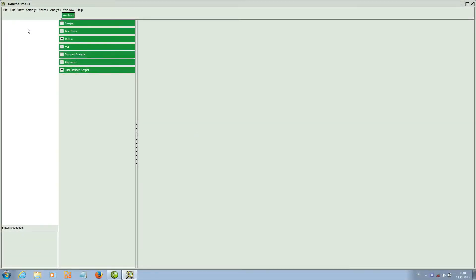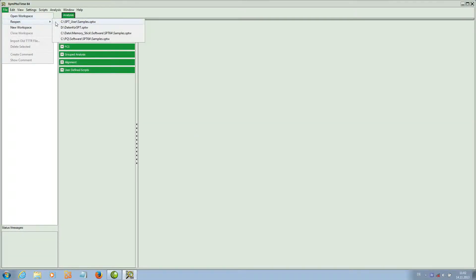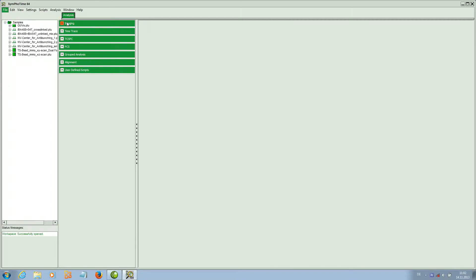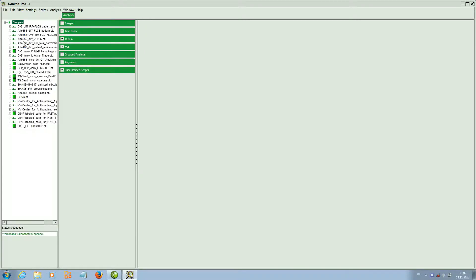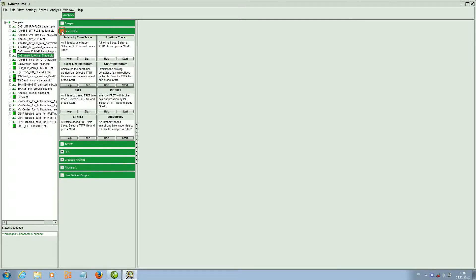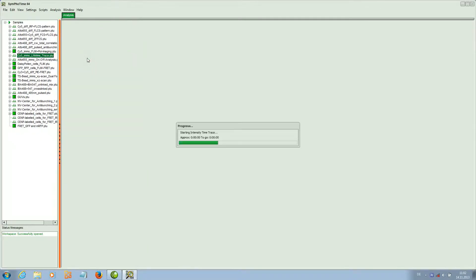In this tutorial we will show the use of the time trace script. We first open the sample workspace and select a file which shows fluctuations of a single molecule.